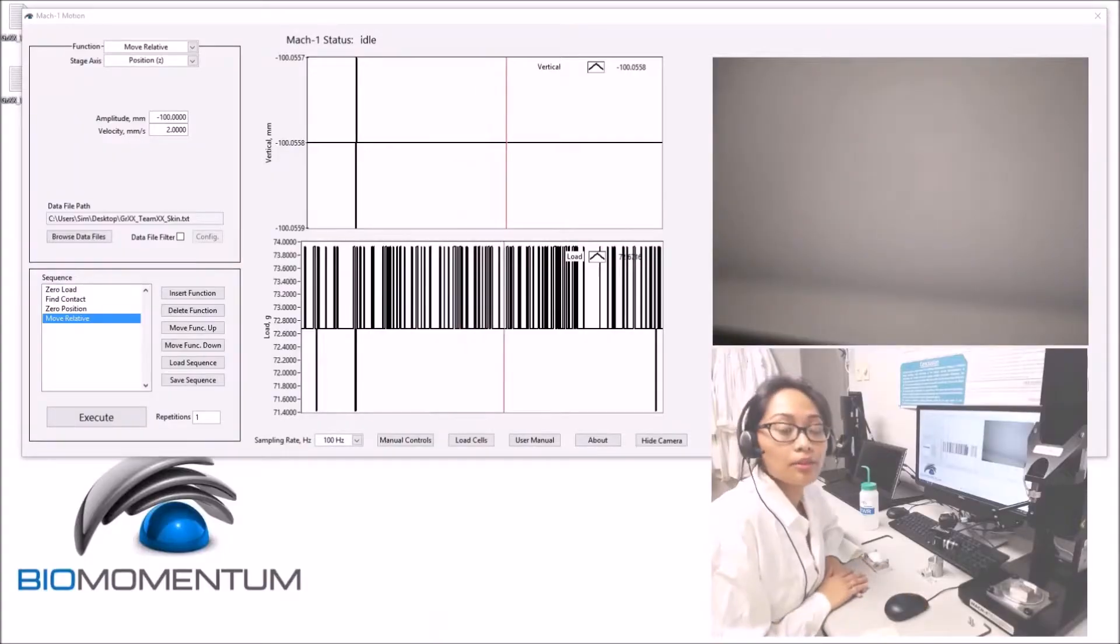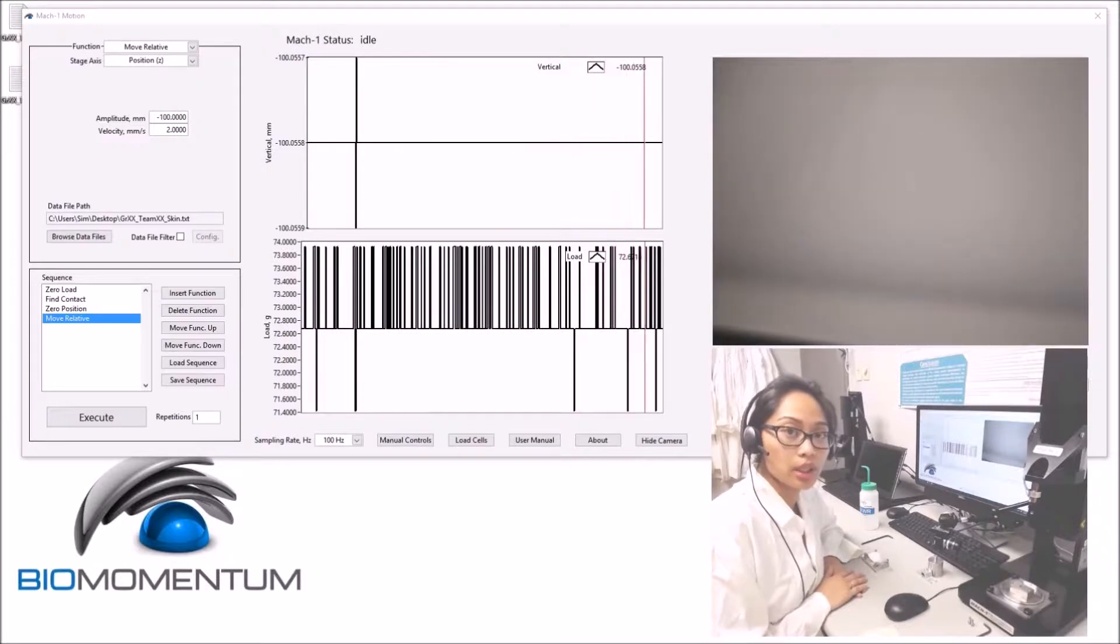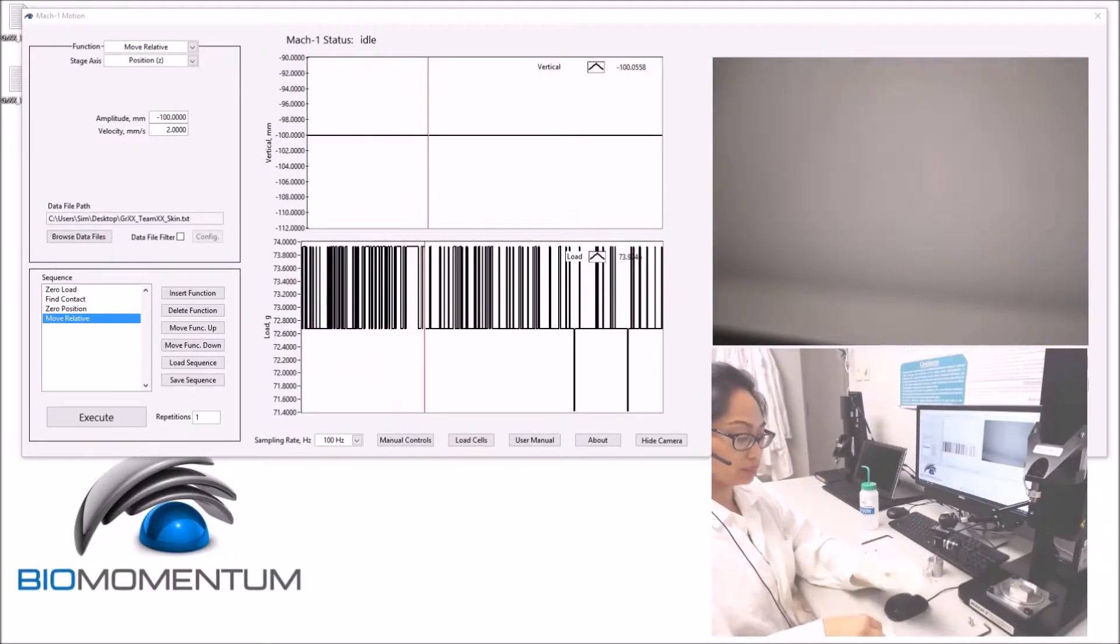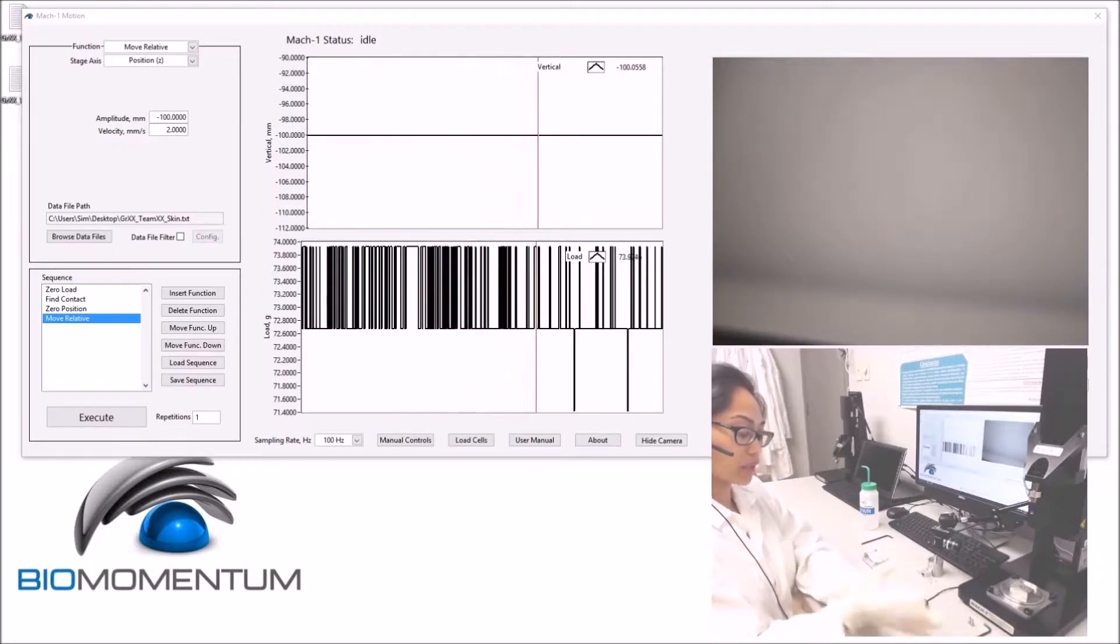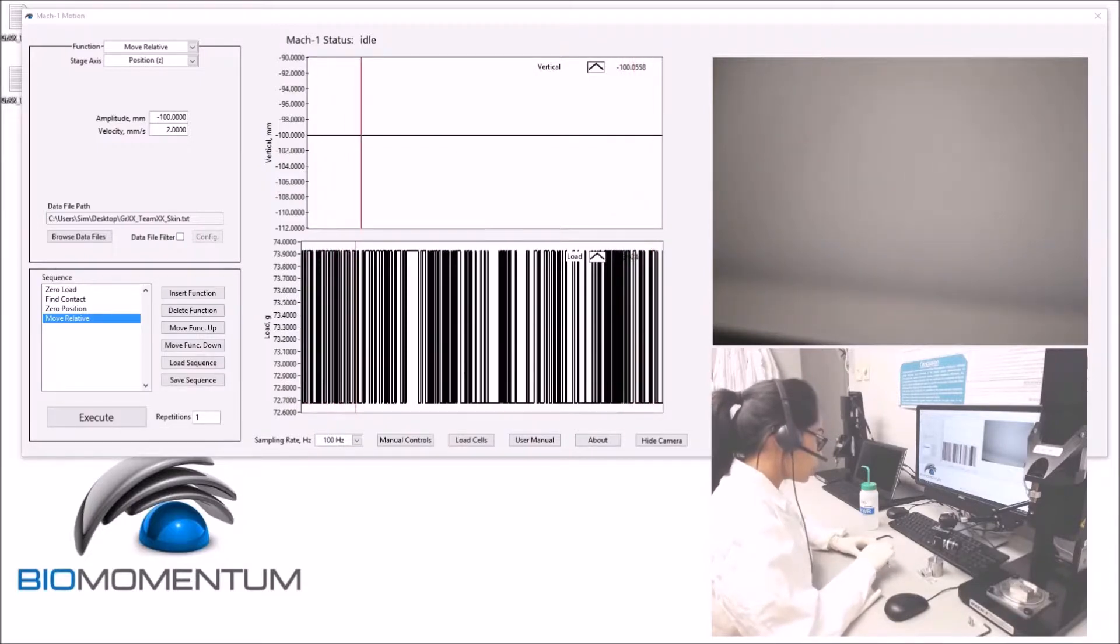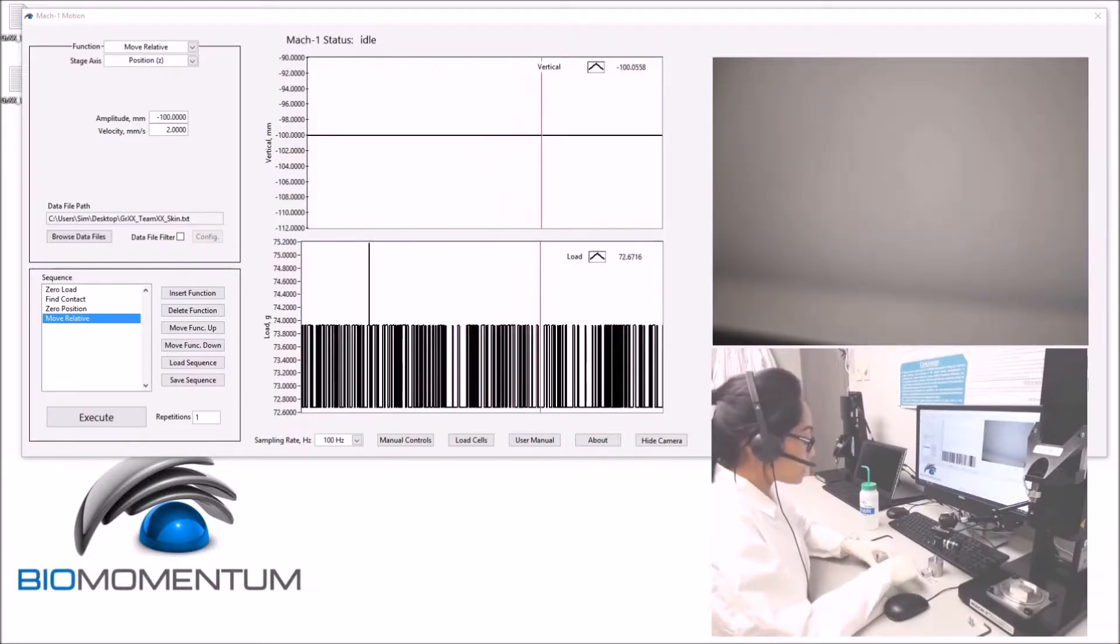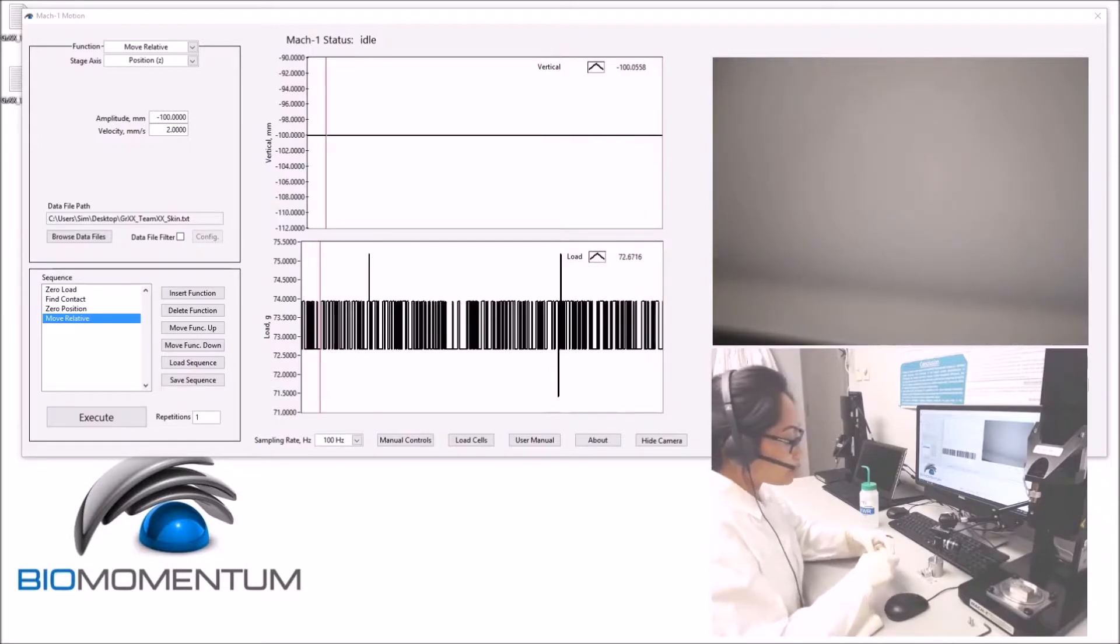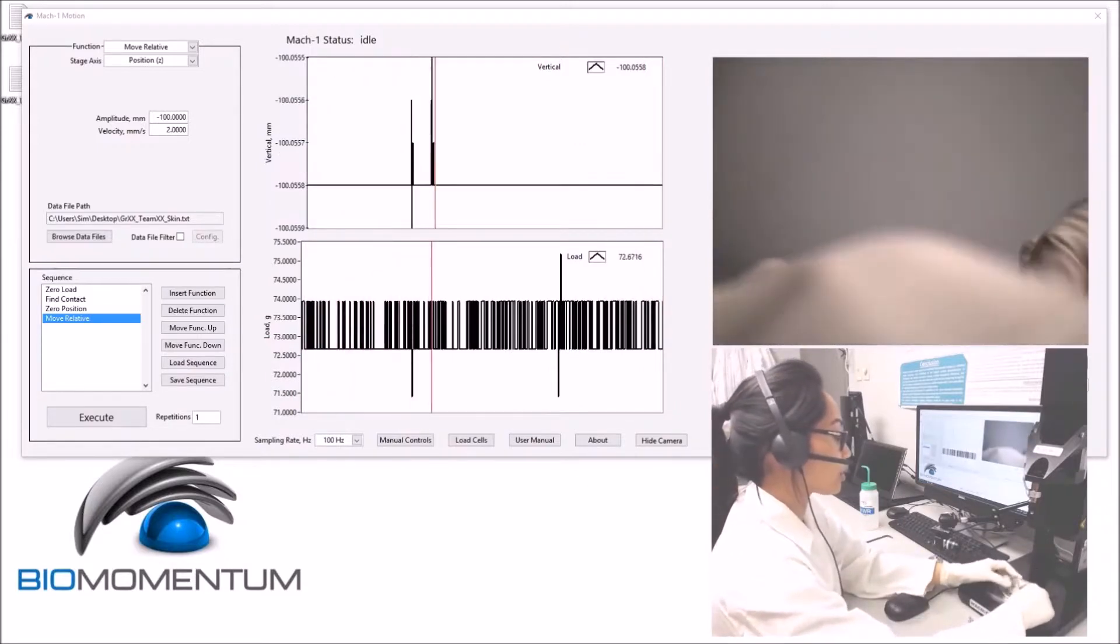Before mounting the skin sample on the mechanical tester, wear some gloves. Ensure that the sample is moist. Remove the tensile grips from the assembly plate and bring the tensile grips to the mechanical tester for installation.